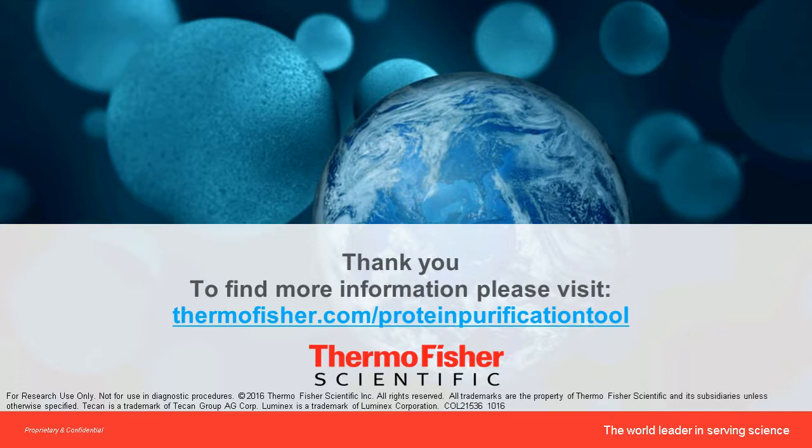Let's have a look at our first question, and it asks, what method do you use for cleanup after IP? Is that something you can answer, Bhavin? Yes. So the IP method that we have optimized uses mass spec compatible wash buffer and elution buffer.